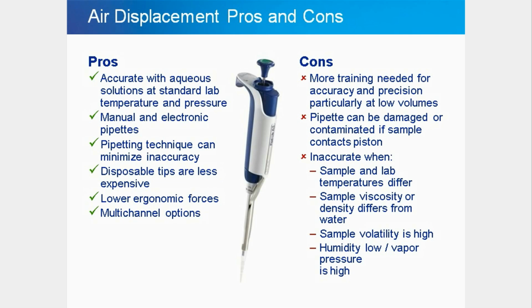They require lower ergonomic force. Negative aspects are, they require more training to achieve accurate results, particularly at low volumes. The pipette can be damaged or contaminated if the sample contacts the piston.